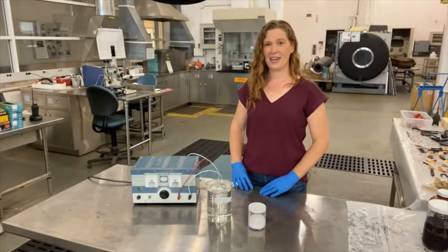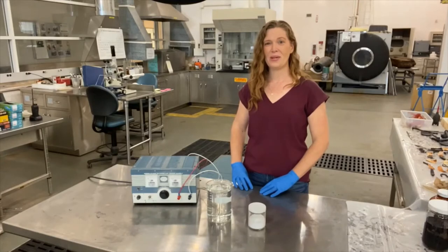Hello, my name is Nicole Dow. I am head conservator here at the Maryland Archaeological Conservation Laboratory and today we're going to be taking a closer look at a conservation technique called electrolytic reduction or electrolysis.